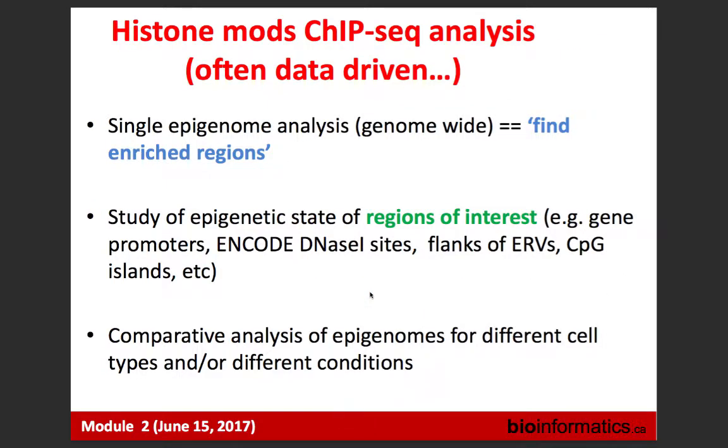So now we're coming to analysis. We have our alignments. We generated our files to be visualized. So what kind of questions can we ask? And I would like you guys to actively participate in this part. What questions can we ask?